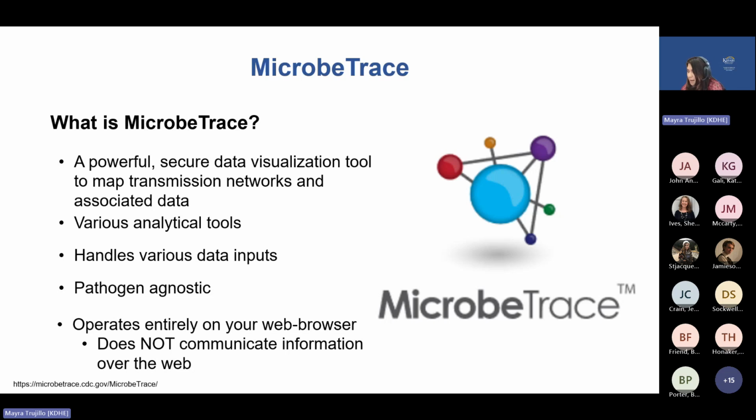Also, MicrobeTrace is pathogen agnostic, meaning it can be used for any pathogen capable of causing an outbreak. While it was originally developed for HIV surveillance, it has since been used across a wide range of diseases. For example, I use it frequently when collaborating with the healthcare-associated infections team for outbreak investigations regarding Carbapenem-resistant organisms. The best part is that MicrobeTrace runs entirely within your web browser and does not transmit any information over the web, which is critical for maintaining data security and HIPAA compliance.